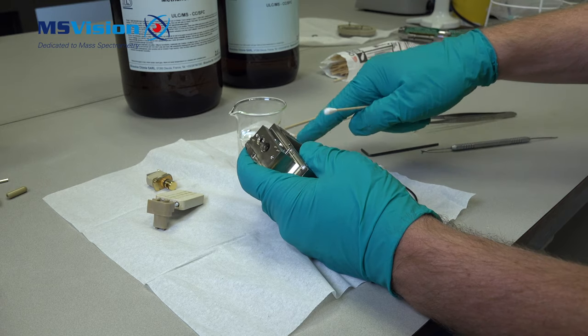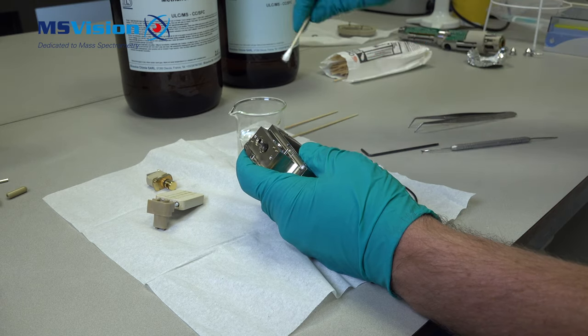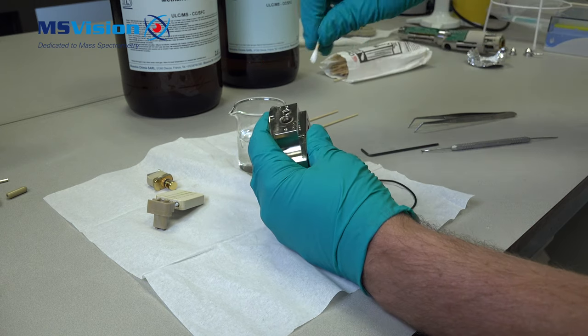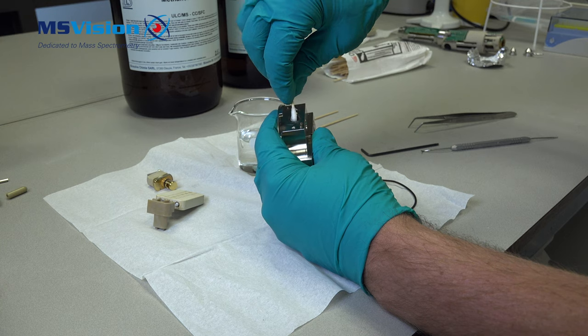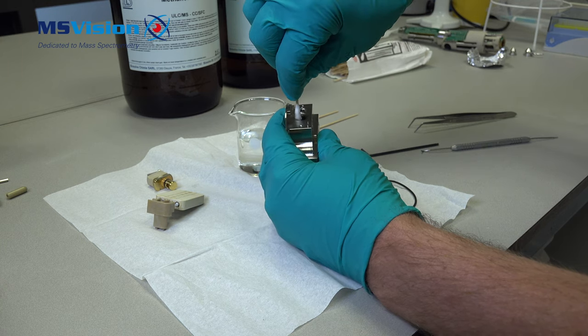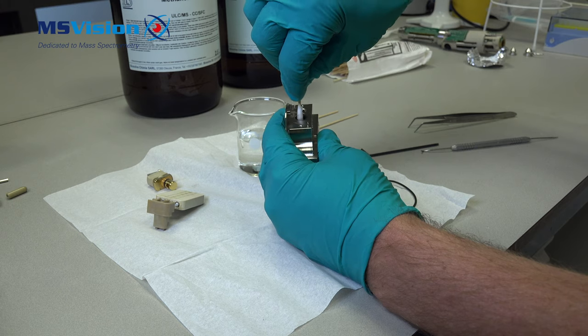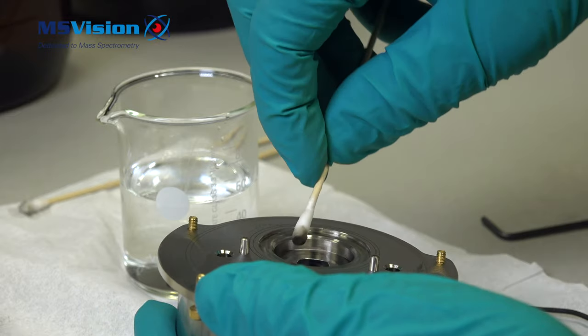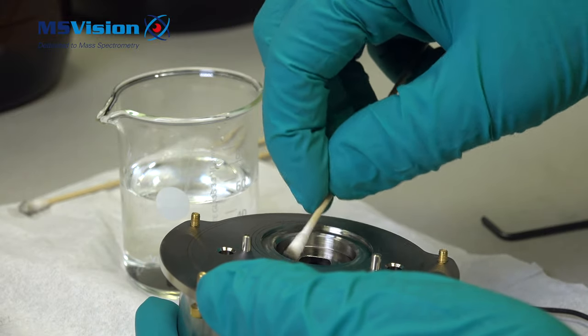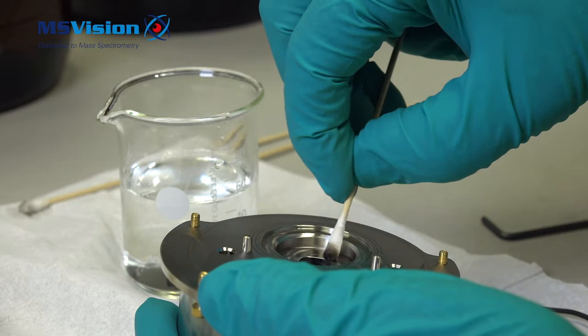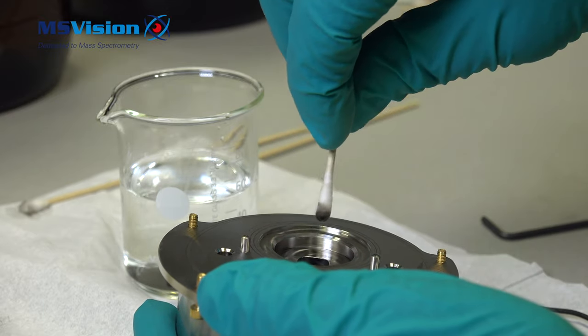To clean it use formic acid and water. Remove most of the dirt you can see, especially inside the block behind where the cone sits. Make sure you use a wooden cotton swab because the formic acid will dissolve plastic ones. Inside the apple shaped hole has to be critically clean. Take care that you don't leave any cotton fibers in here because one fiber is enough to result in source charging.